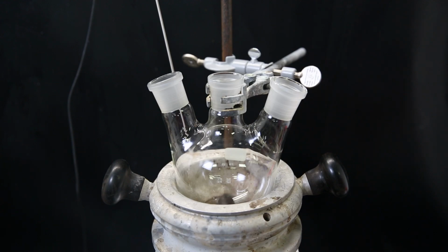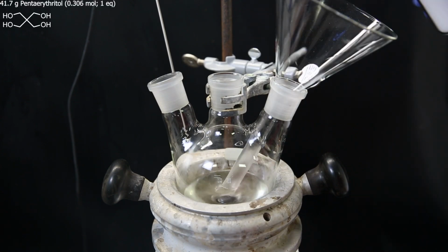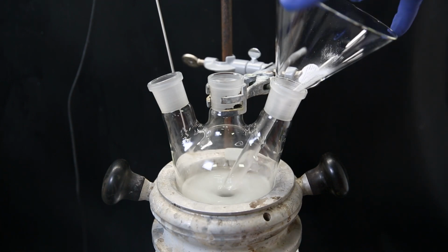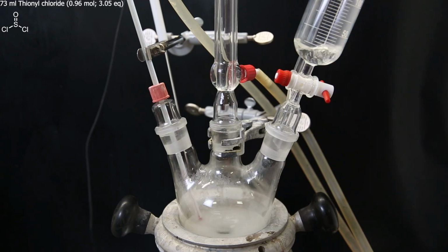So I set up a 3-neck flask with a stir bar in a heating mantle and add 72 ml of pyridine. I then add a funnel and 41.7 grams of pentaerythritol. I remove the funnel and attach a thermometer to track the internal temperature. Then I attach a condenser and a dropping funnel. And to the dropping funnel, I add 73 ml of thionyl chloride.